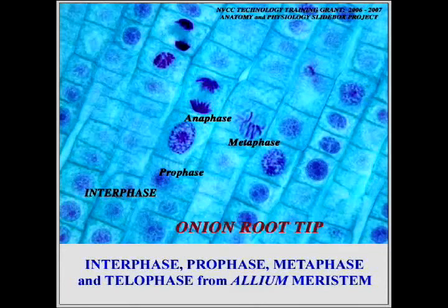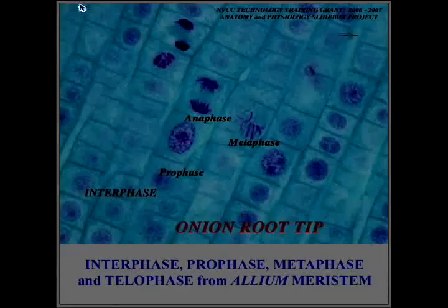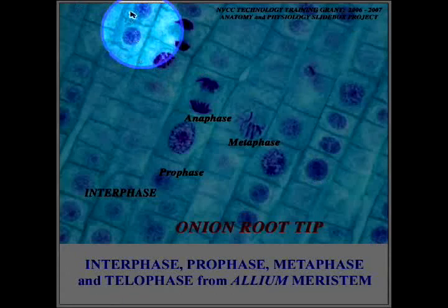I can tell that they're in telophase, they just finished telophase, because first of all, the cells are small. These cells are much larger over here. These cells are larger, and these are small. Here's the cell plate that's starting to form, or has formed rather, between the two. I should point out, let me just type in the fact that these are telophase. Let's see if I can type that in.